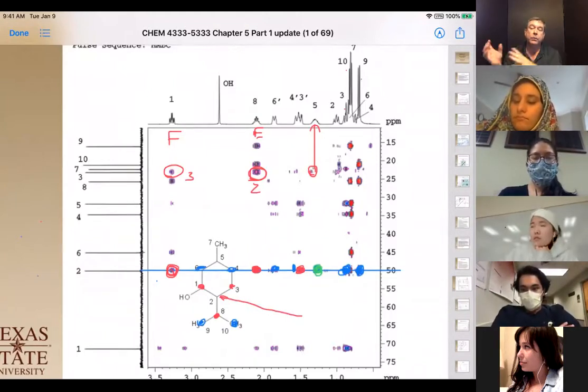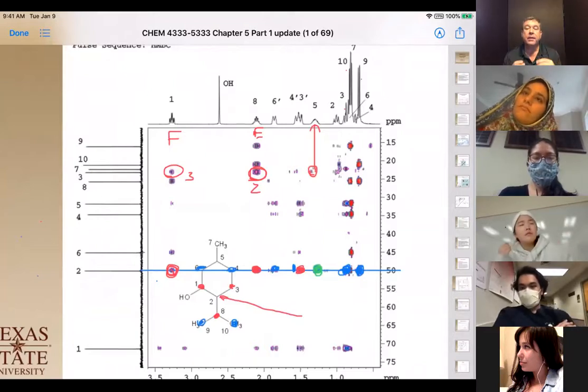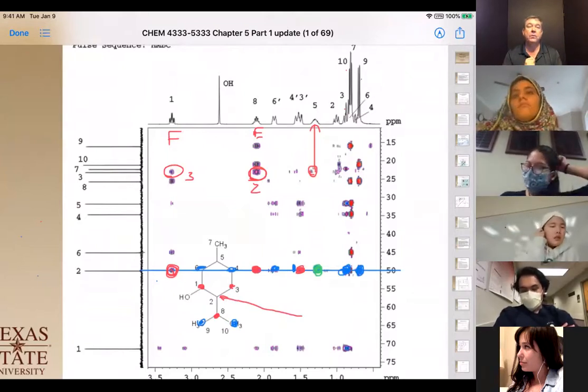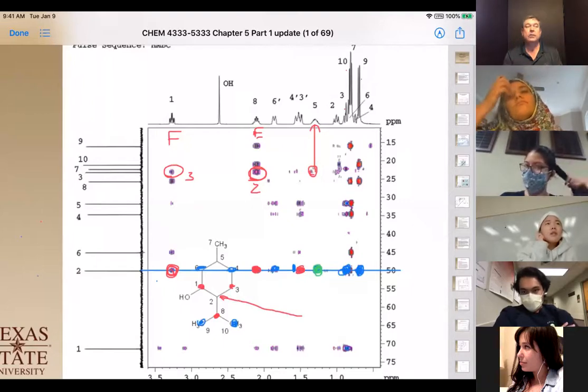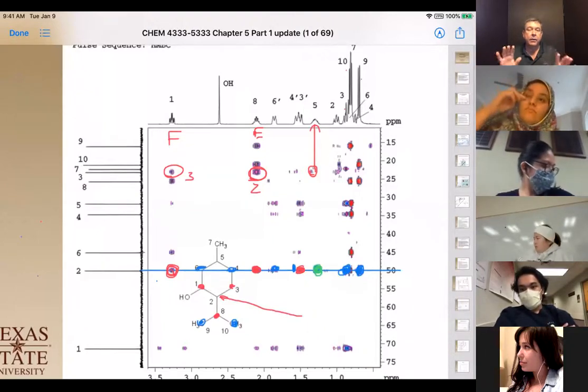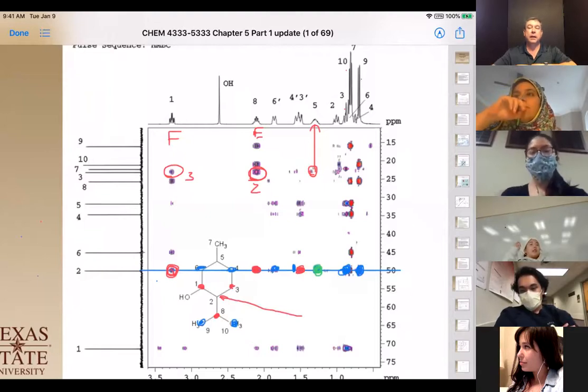So we'll have like 1 or 2 or 3 choices based on just shift, position and integration. But then we have to use that to say it can be this one, it can't be this one, it can't be this one. So rarely do you run to here to get the first attempt at drawing your structure. You actually say, it could be this, could be this, could be this. I don't have enough information with just the shift to prove one or the other. That's where the HETCOR experiments help you decide which of those it can be.